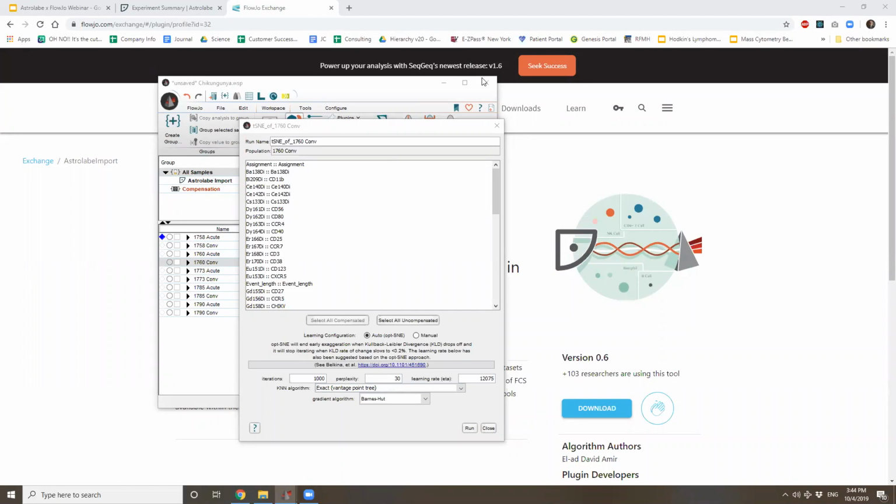And we can reduce the number of calculations as we move through the data, coming up with a map of which cells are neighbors to each other. And as Elad mentioned, we've done a lot of test cases to see what you lose by approximating, and it seems inconsequential. I get what appears to be the exact same results using both ways, and the Annoy algorithm seems to be significantly faster. So I really do like using that.